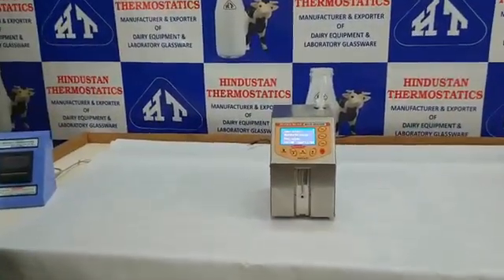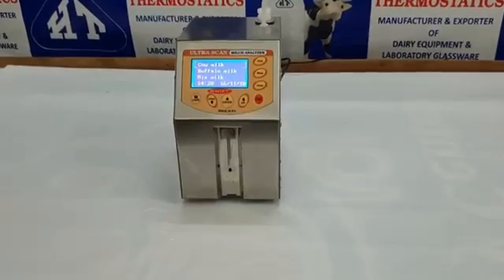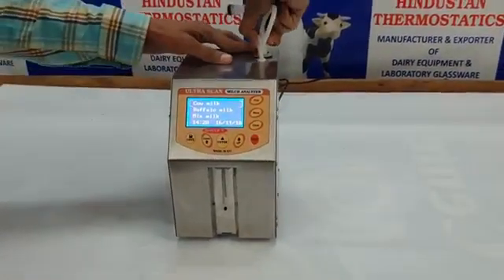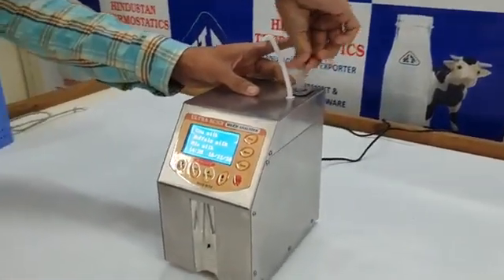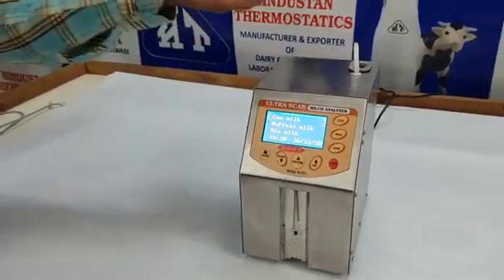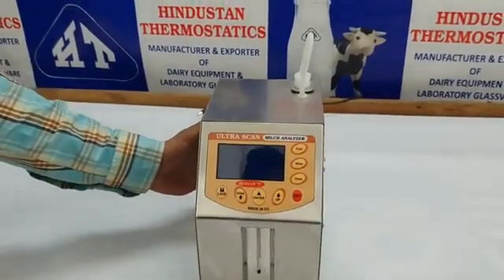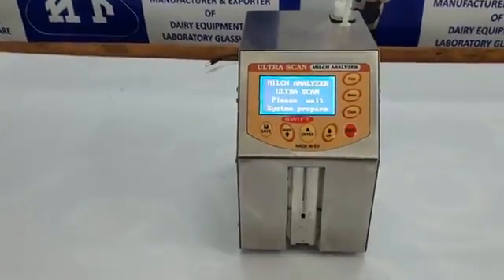The highlights of Ultrascan include it being a product made purely for Indian conditions and power issues in remote areas. It has a manual plunger cleaning option — in case of power failure, the machine can be cleaned by plunger method. Another unique feature is that there is no warm-up time for initial starting.